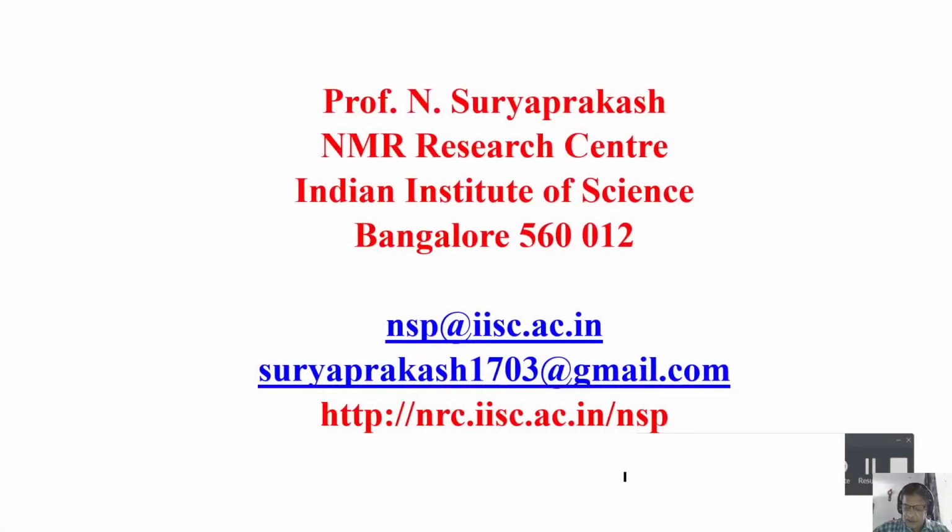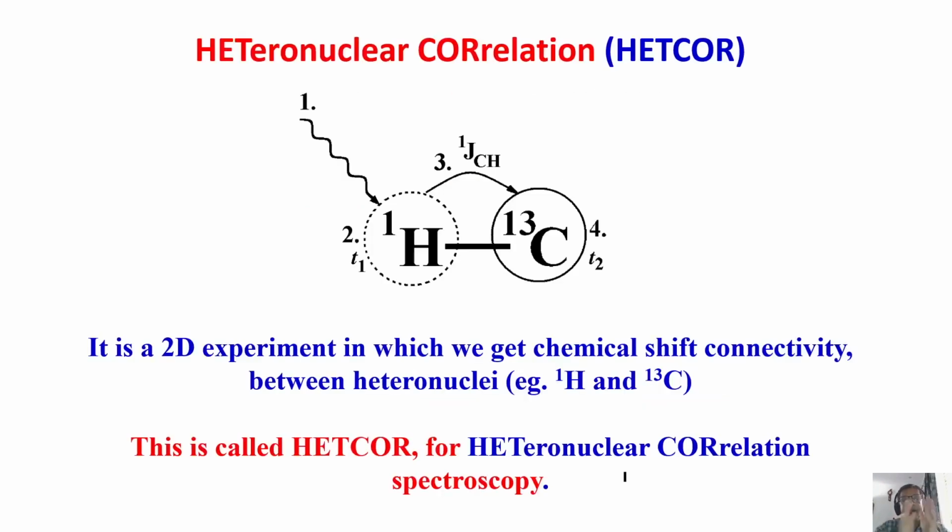Welcome back. So, last couple of weeks we have been discussing various two-dimensional experiments. I have already discussed COSY, TOCSY and other sequences and took several examples of that. Today, we will go to the heteronuclear correlation experiment.